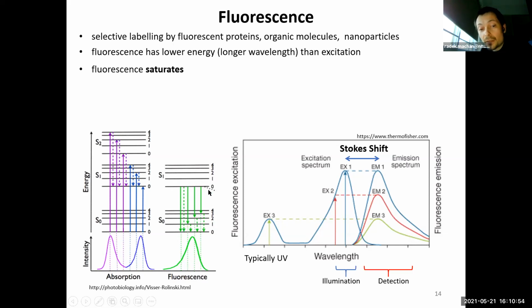And while the molecule is in the excited state, I can't excite it again. So when I excite a molecule, if any other photon comes in the way, it can't excite the molecule until the molecule returns to the ground state.